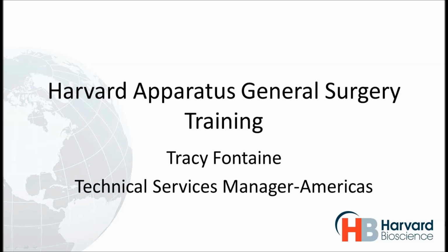My name is Tracy Fontaine. I am the Technical Services Manager for the Americas. Today we are going to go over the general definition of surgery and then move on to some major pieces of equipment that are required and how Harvard Apparatus may be able to assist the researcher.